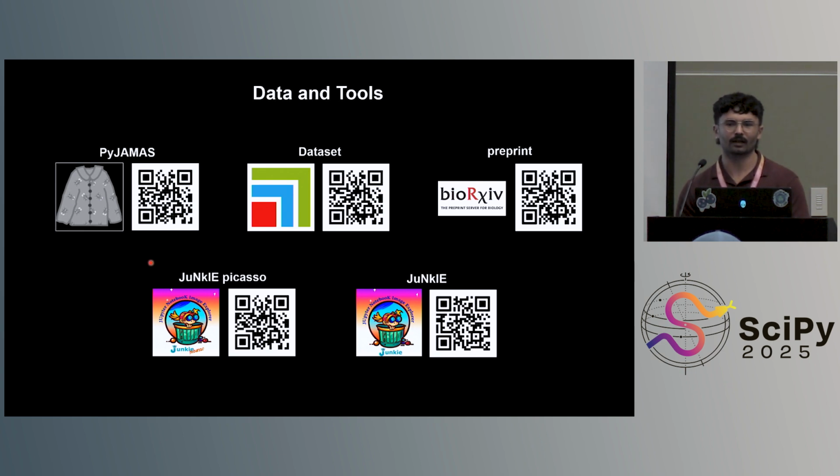At least in my own experience, I have never had an issue where I give it one cell and then it segments a different cell that's nearby. As far as I've been able to tell, it has 100% accuracy. So that removes another step in the pipeline. You don't have to put this through another tracking algorithm.